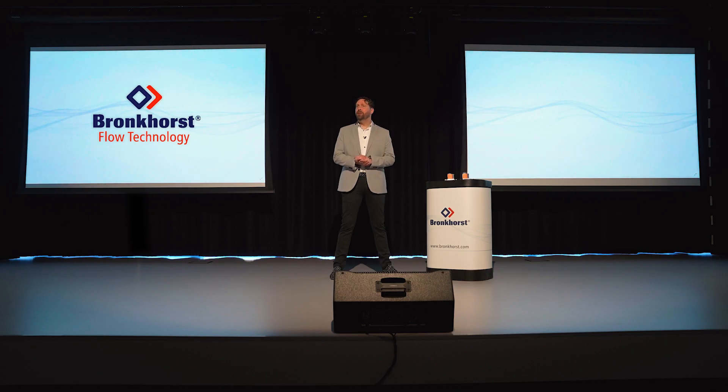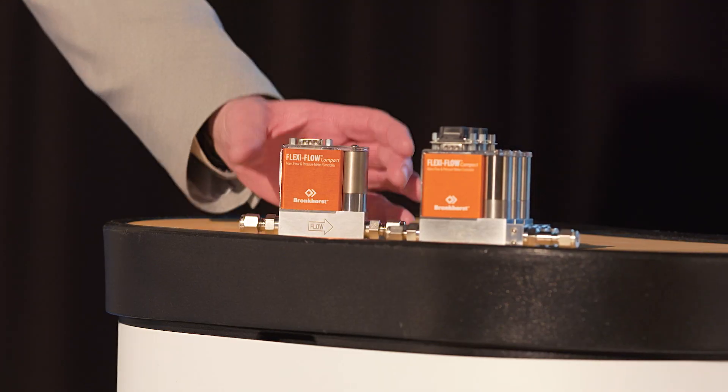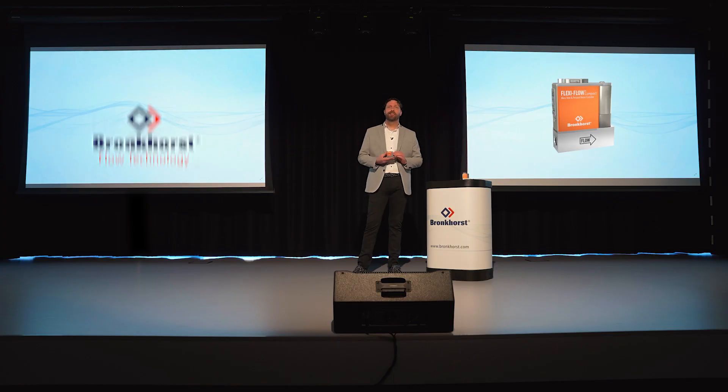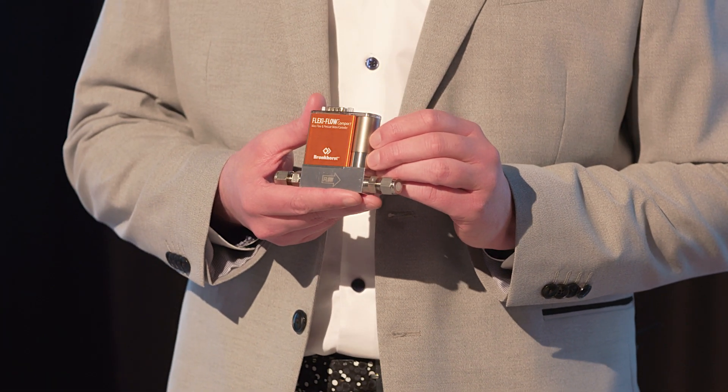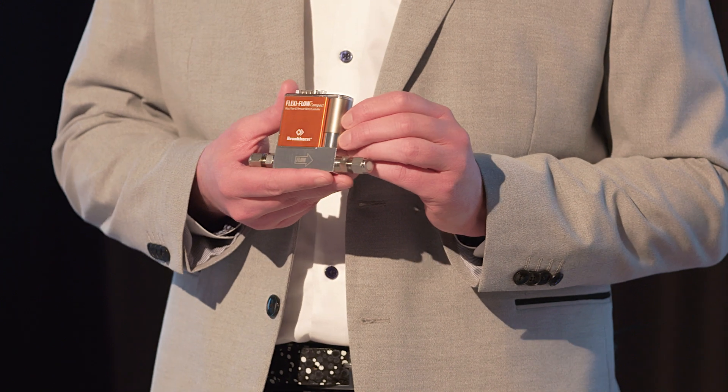Bronkhorst is proud to introduce a revolutionary new product series, the FlexiFlow Compact. We developed a truly unique thermal mass flow measurement technique that combines the advantages of the MEMS chip sensor with our proven bypass technology.